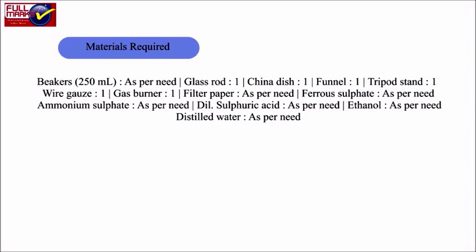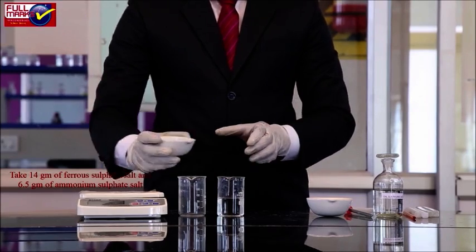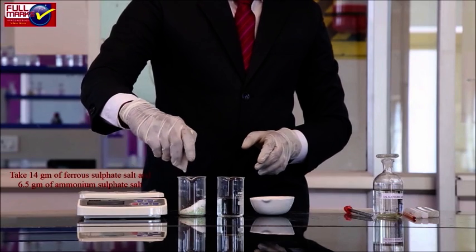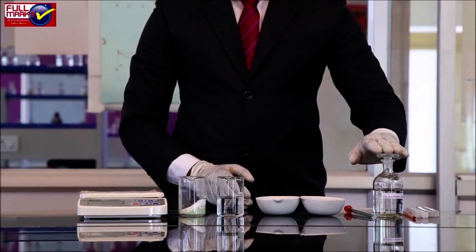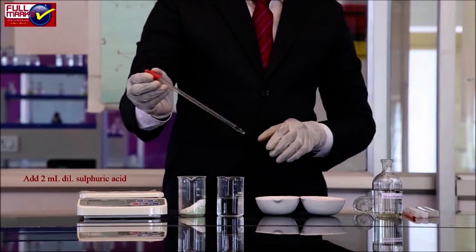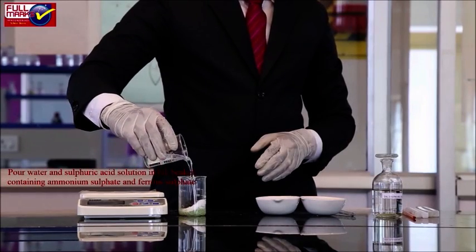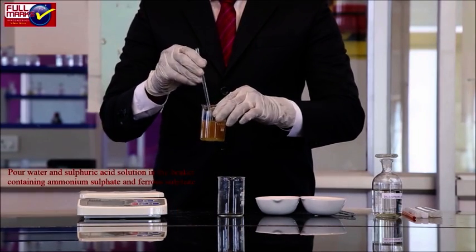Procedure — preparation of solution: Take 14 grams of ferrous sulphate salt and 6.5 grams of ammonium sulphate salt in a clean beaker. Boil 50 ml of water in another beaker to expel dissolved air and add 2 ml of dilute sulphuric acid in it. Pour the water and sulphuric acid solution into the beaker containing ammonium sulphate and ferrous sulphate; stir well to dissolve the salts.